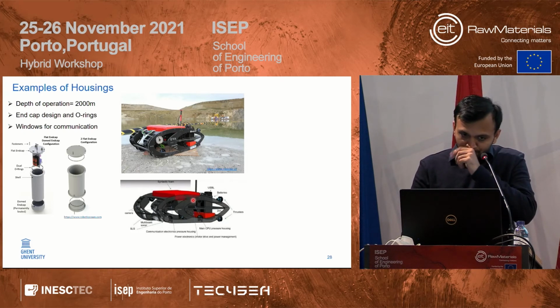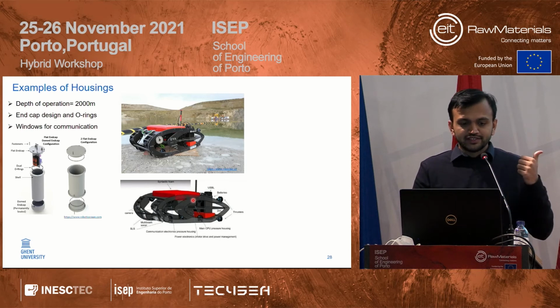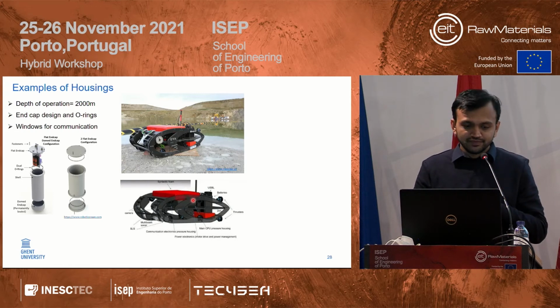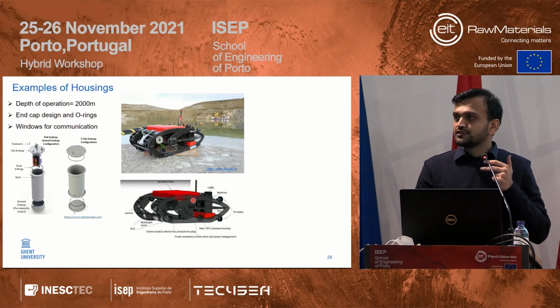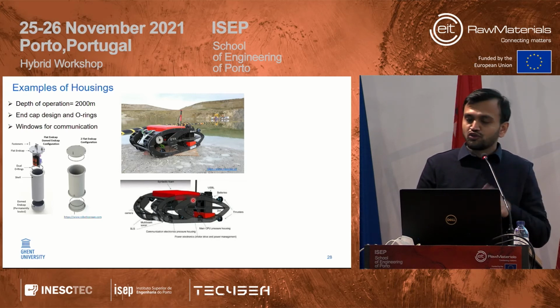Depending upon the depth of operation, a maximum of 2 km or 2000 meters, you can see here a figure: end cap designs and the selected O-rings and windows for the communication. Here they considered 2 different end caps, one a flat end cap and one more a domed end cap.